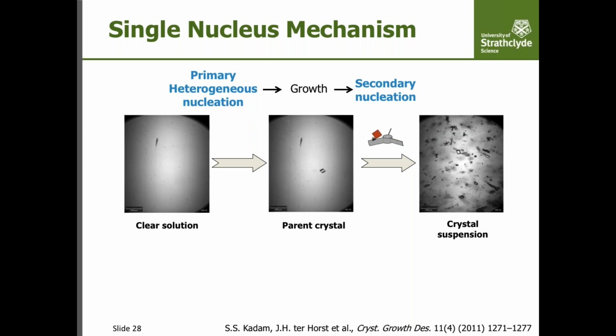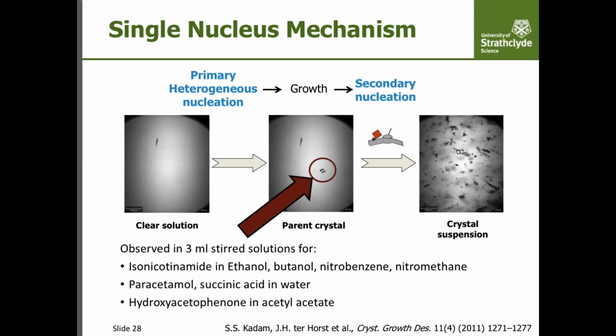So there's some lag in our measurement of induction time. The induction time is not the point of nucleation, but it is the point where we detect a large number of crystals due to the nucleation of a single crystal. We observe this in many stirred solutions. So we really think that this is something that is a general mechanism. So this single nucleus mechanism.